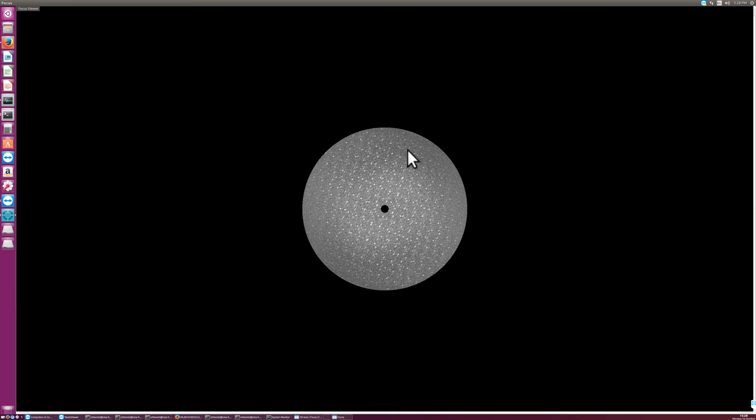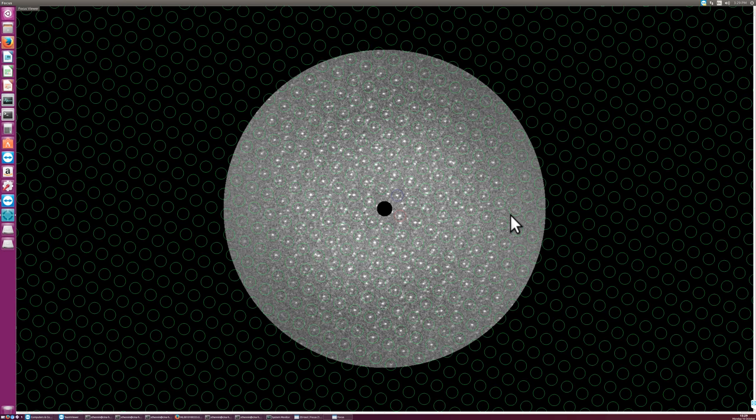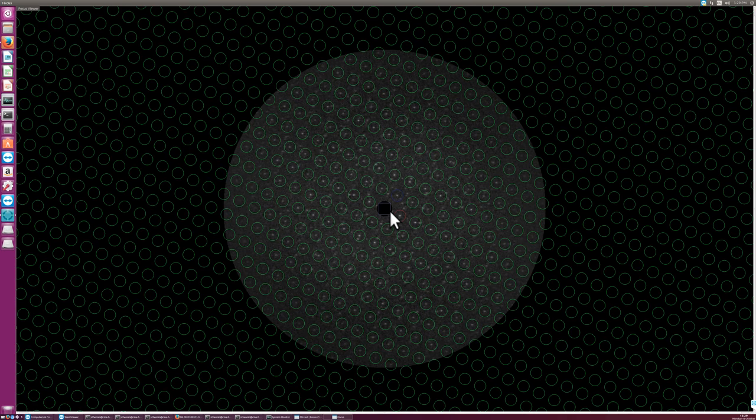If I click on this origin shifted power spectrum and now press L, the key L is displaying the lattice here. It shows a lattice, N to make it darker. This looks actually good. The first lattice is the red circle, the second one is the blue one. This looks like a reasonable lattice, so it found it. There is a second lattice register, which I get with S, and that is not yet existing. So the second lattice is not known. But this looks good.